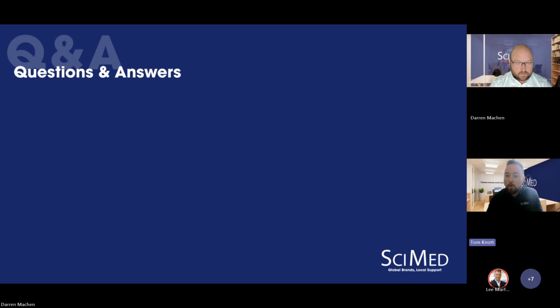We have had a question pop into the chat for yourself, Darren, that says, can you see it? Yeah, I can see that. So we're talking about how a peak's identified. For example, you change the moisture content, you'll see a peak at 1400 get bigger and smaller. So there are areas in various overtones where you see the peaks for each band, for each parameter. And when you develop a calibration, if you're referencing against protein, you'll see the loading on that part of the spectrum will be quite high, and that's correlated to protein. So there are some reference peaks that you can use.